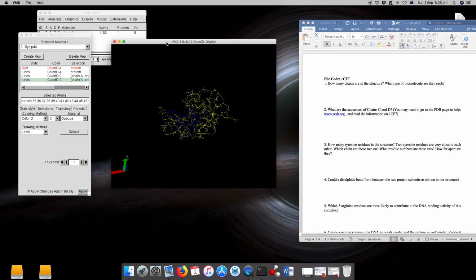So I'm going to put the file name, which is that one. Okay, so you can see now this is a different molecule. It's a transcription factor, E2F. And again, it's from human expression system E. coli. We know the literature, so the paper, and also extra information. So for now, I'm just going to download the PDB file, and then we will go through the other information.